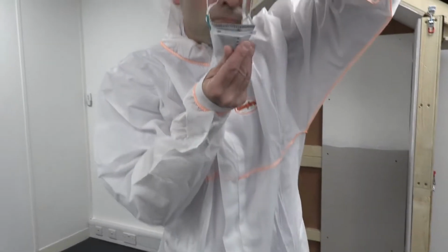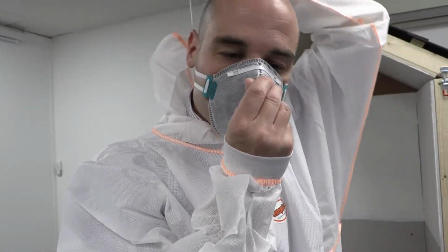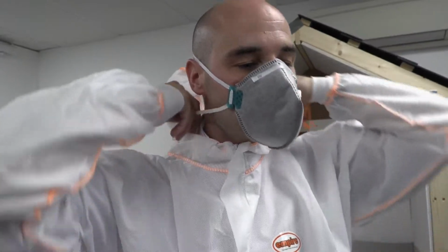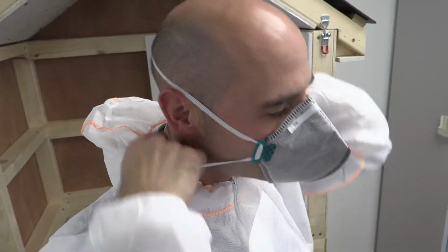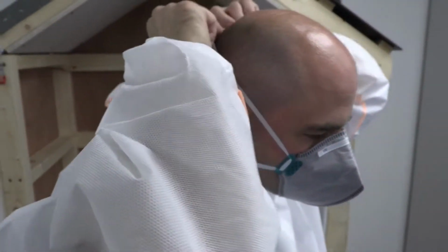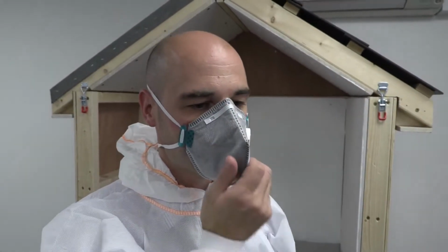Put on the disposable mask. You should be clean shaven to ensure the mask provides an airtight seal. Ensure the straps are in the correct position and not tangled. The elasticated bottom strap of the mask should be positioned around the neck and the top strap around the crown of your head. Pinch the nose clip to ensure a good seal with the face.